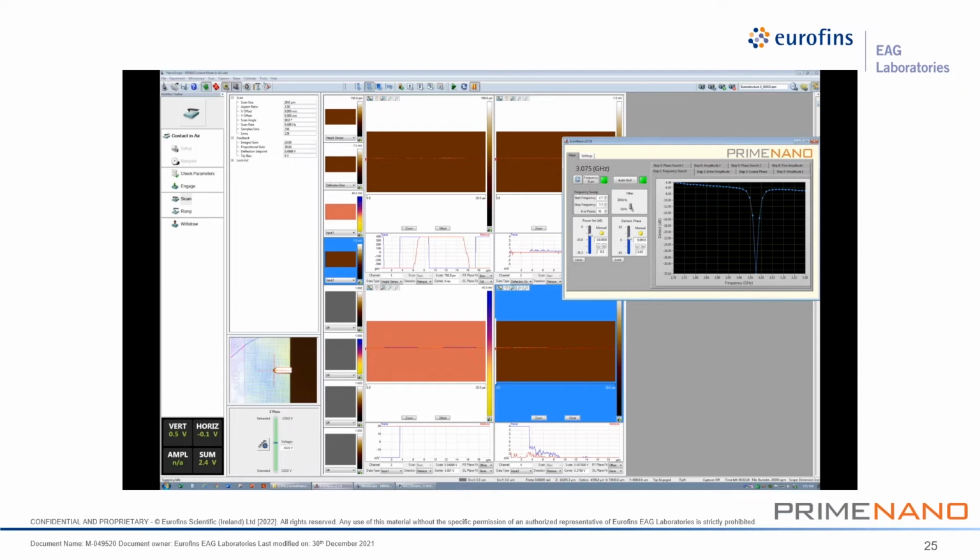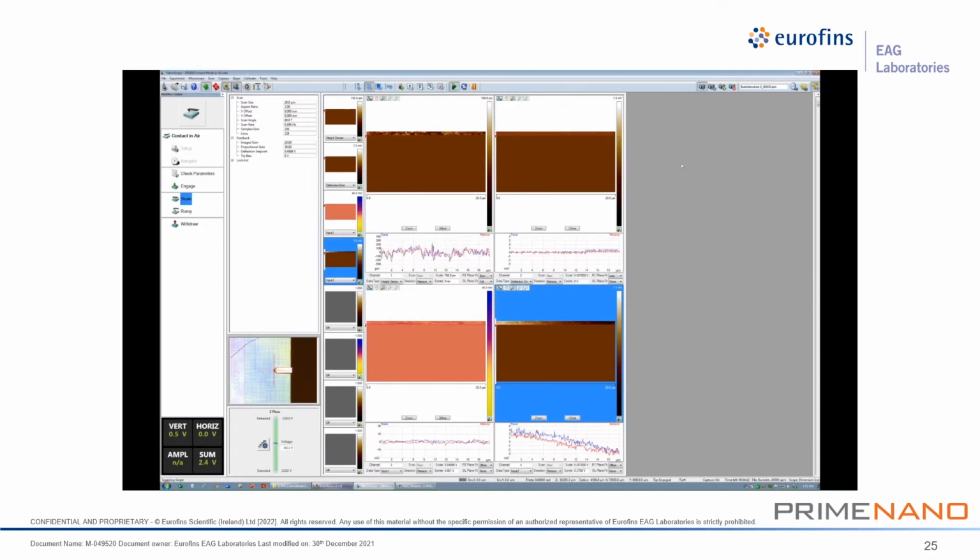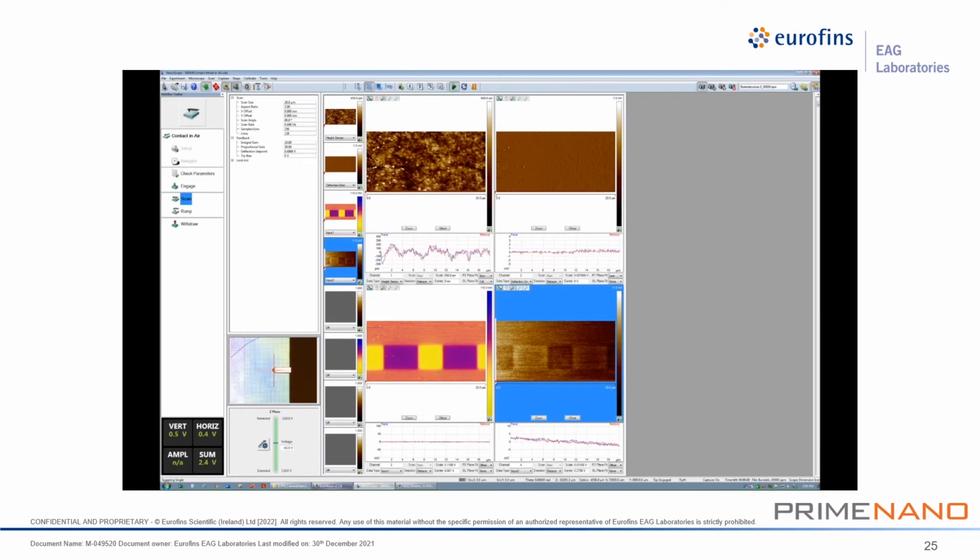Okay, it plays now. What we see here is a frequency sweep wherein we sweep the microwave frequencies and only one frequency is selected, which is about 3 gigahertz. And I fastened up the video just to show the topography on the top left here. And then we have the sMIM image, capacitance image showing in the bottom left here. We can clearly see that while there is no variation in the topography, we can clearly see the islands which are buried deeper. It's about 200 nanometers deeper into the surface.